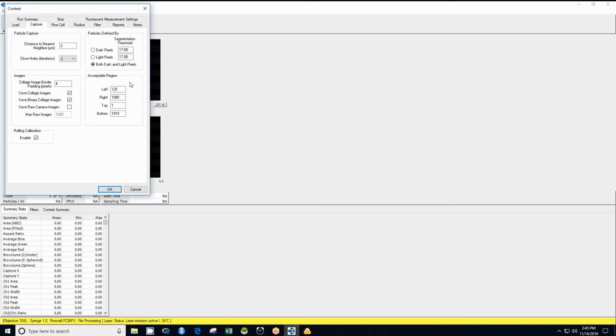Rolling calibration is a newer feature available, and it's useful when particles get stuck in the flow channel and won't be imaged repeatedly. Selecting this value automatically establishes a continuous overlay of 10 sequential frames to compose the calibration image. This is repeated throughout the sample run.